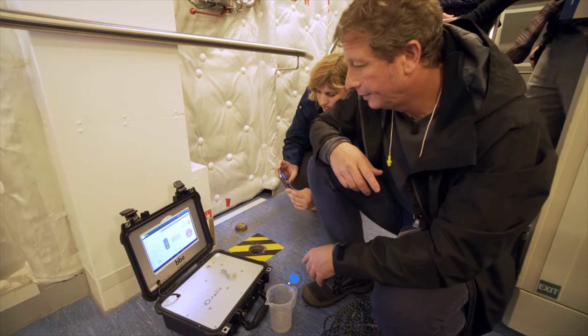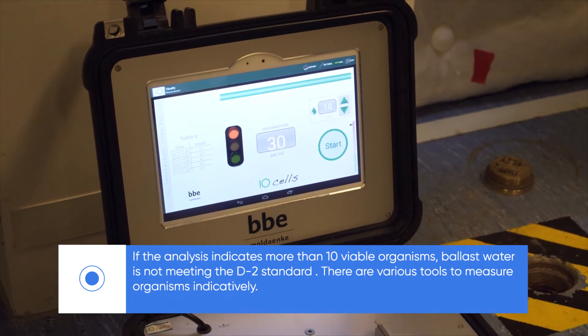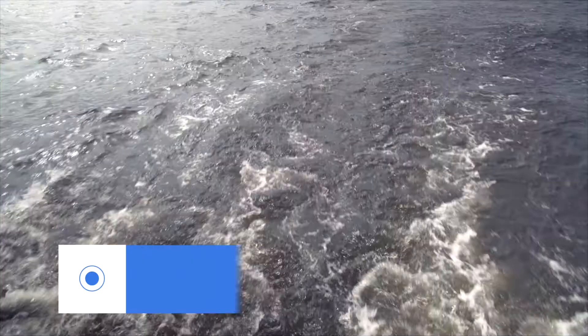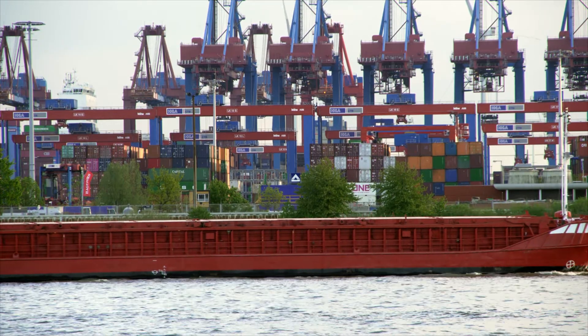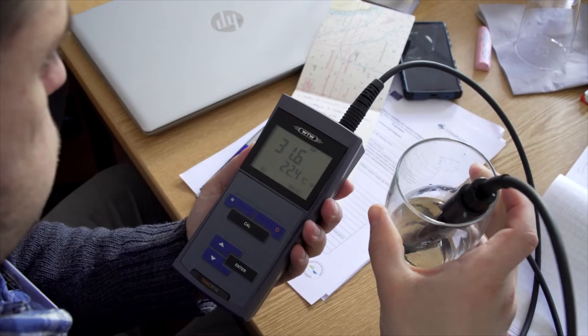This takes about a minute, and this takes about 20 minutes. No tool at the moment is certified or approved, because they cannot be approved to something — first you need the concrete regulation to which they can be approved. So there are no measures to which these tools can be approved, but they are being developed now, and it's good that this development proceeds.